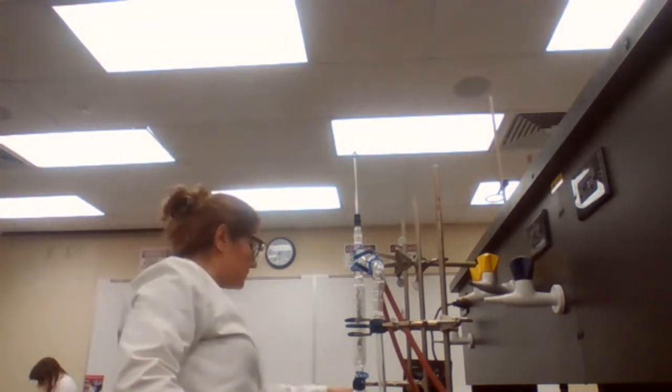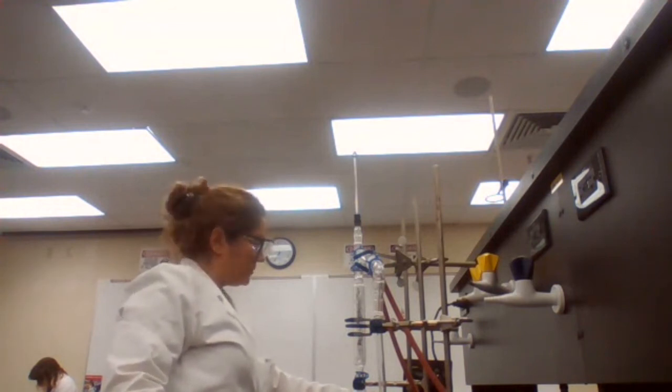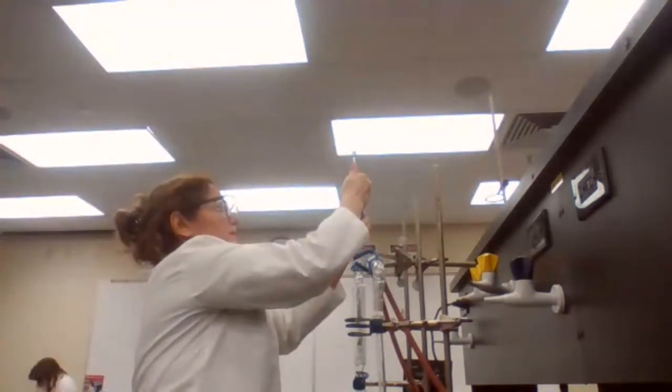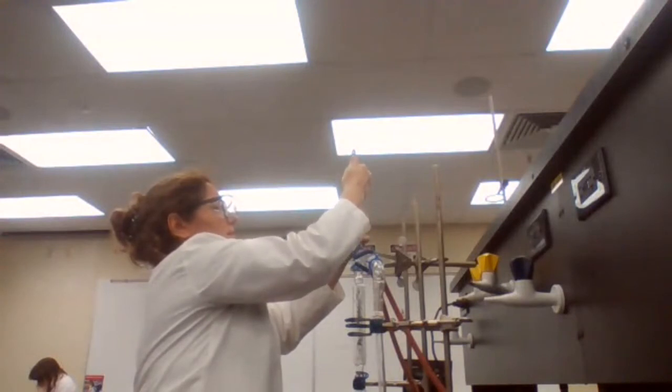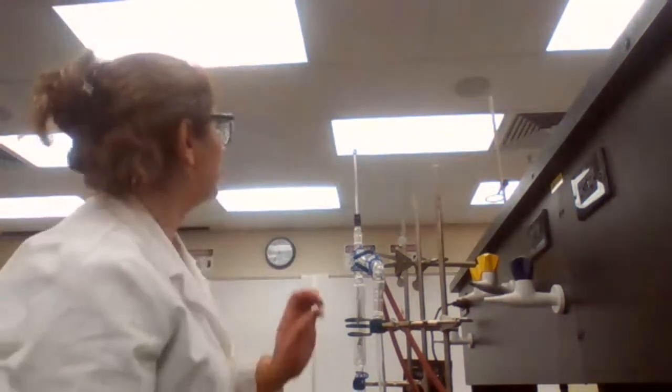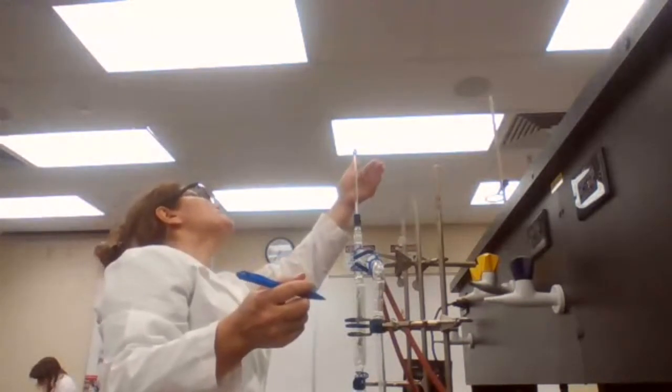So the first drop, we actually got to it too quickly here. First milliliter is 76. Second milliliter, it's faster than what I was expecting, really. So first milliliter was 76. This is not the first drop. I missed the first drop.